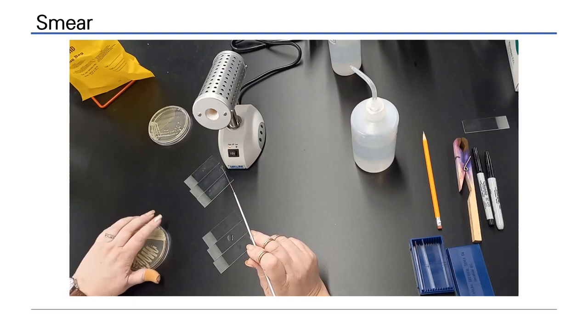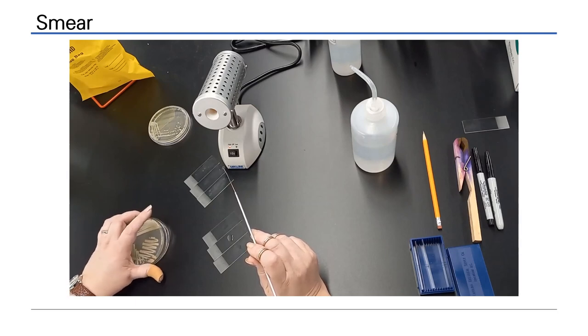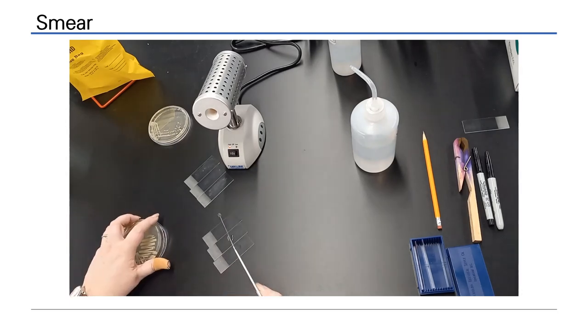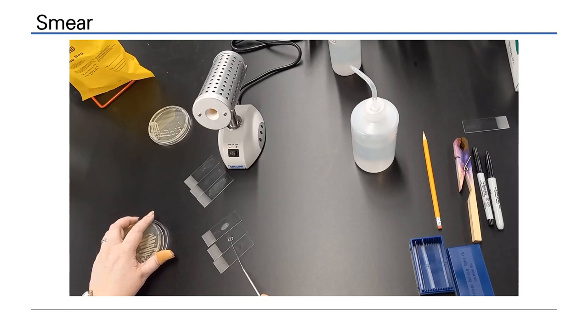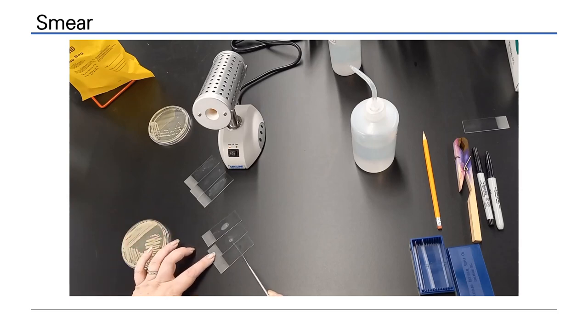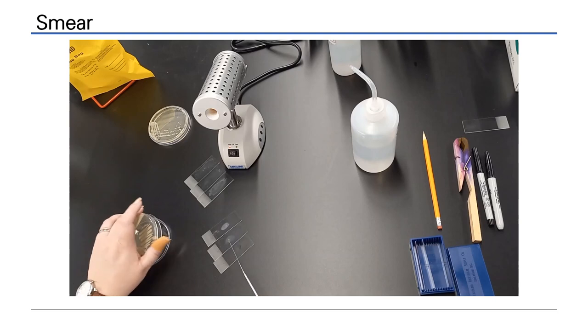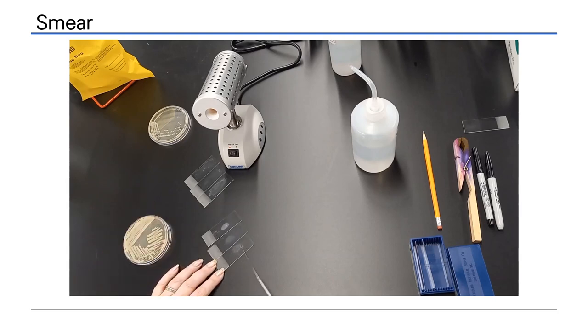The slides here will show you what happens when there is, at the top, too small a drop, in the middle, too large a drop, and at the bottom slide, just right. Remove a small amount of culture. Re-suspend with circular motion. Repeat the process for the next slide. This drop was too large. As we try to re-suspend the cells, the water is moving across the slide. The last one is just right. It re-suspends easily, with no risk of splashing onto the bench.